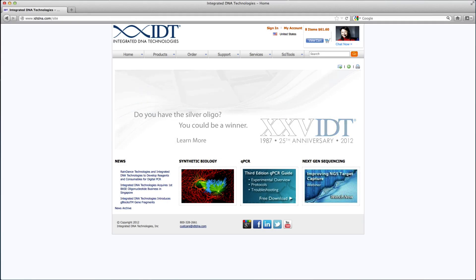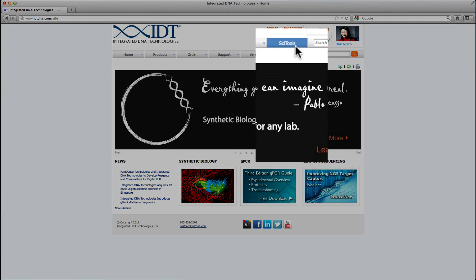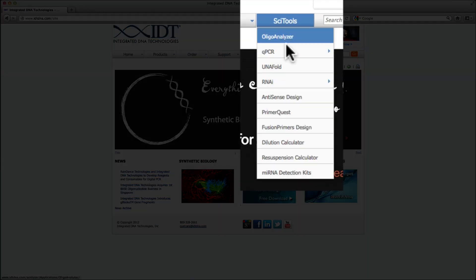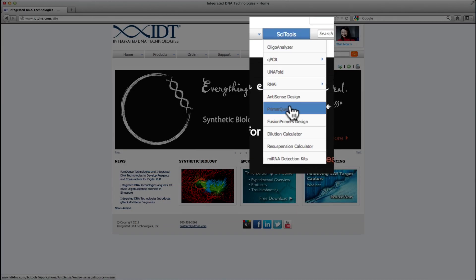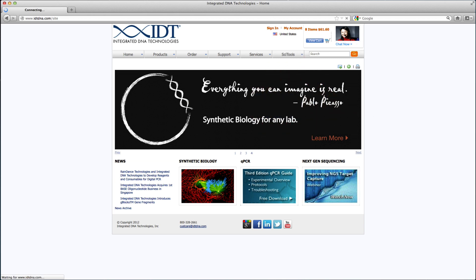Hello, my name is Afton Vanderswag and I work in technical support here at IDT. What we are going to show you is the way in which you can design a probe sequence against two primer sequences that you already have designed.